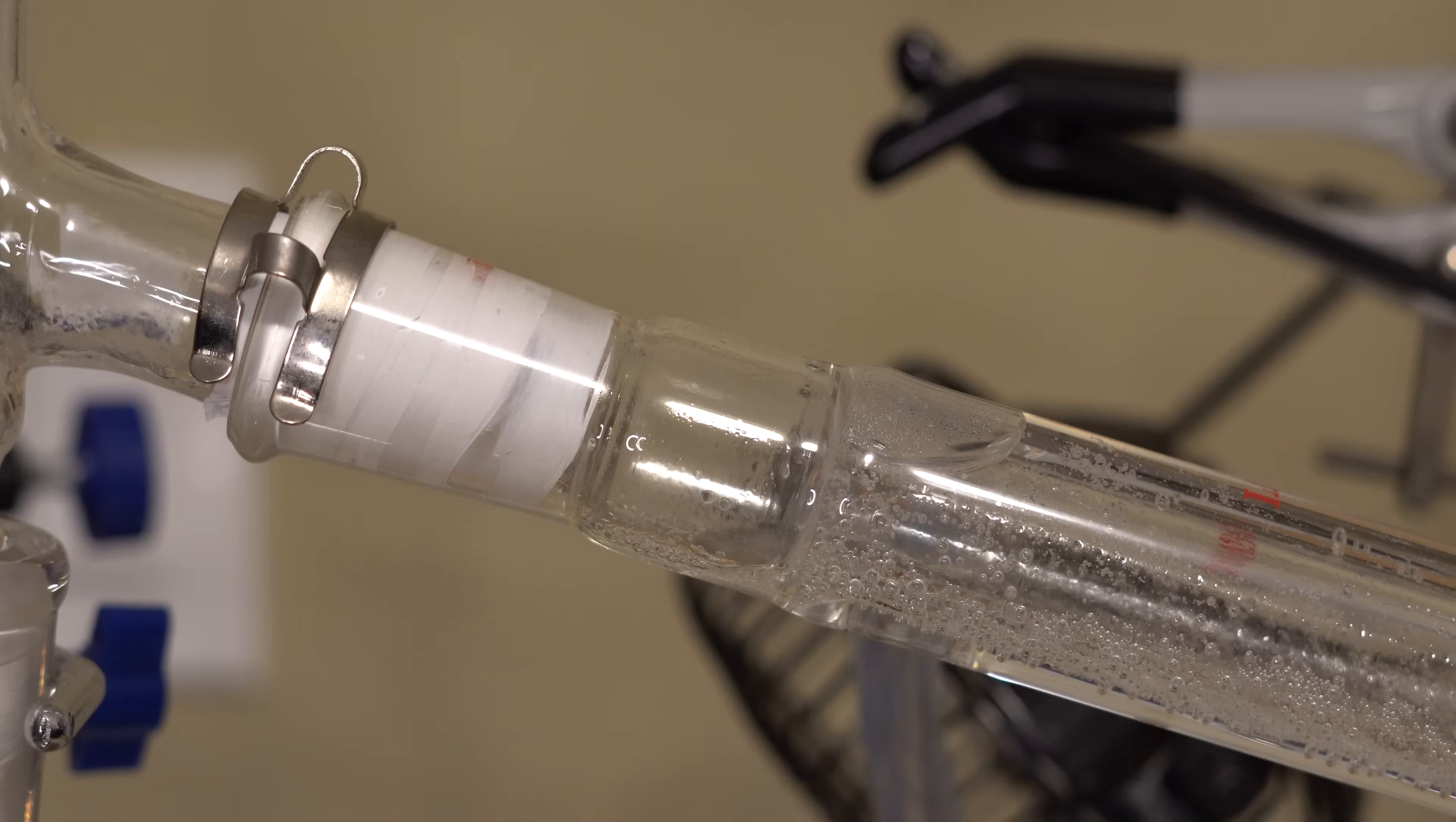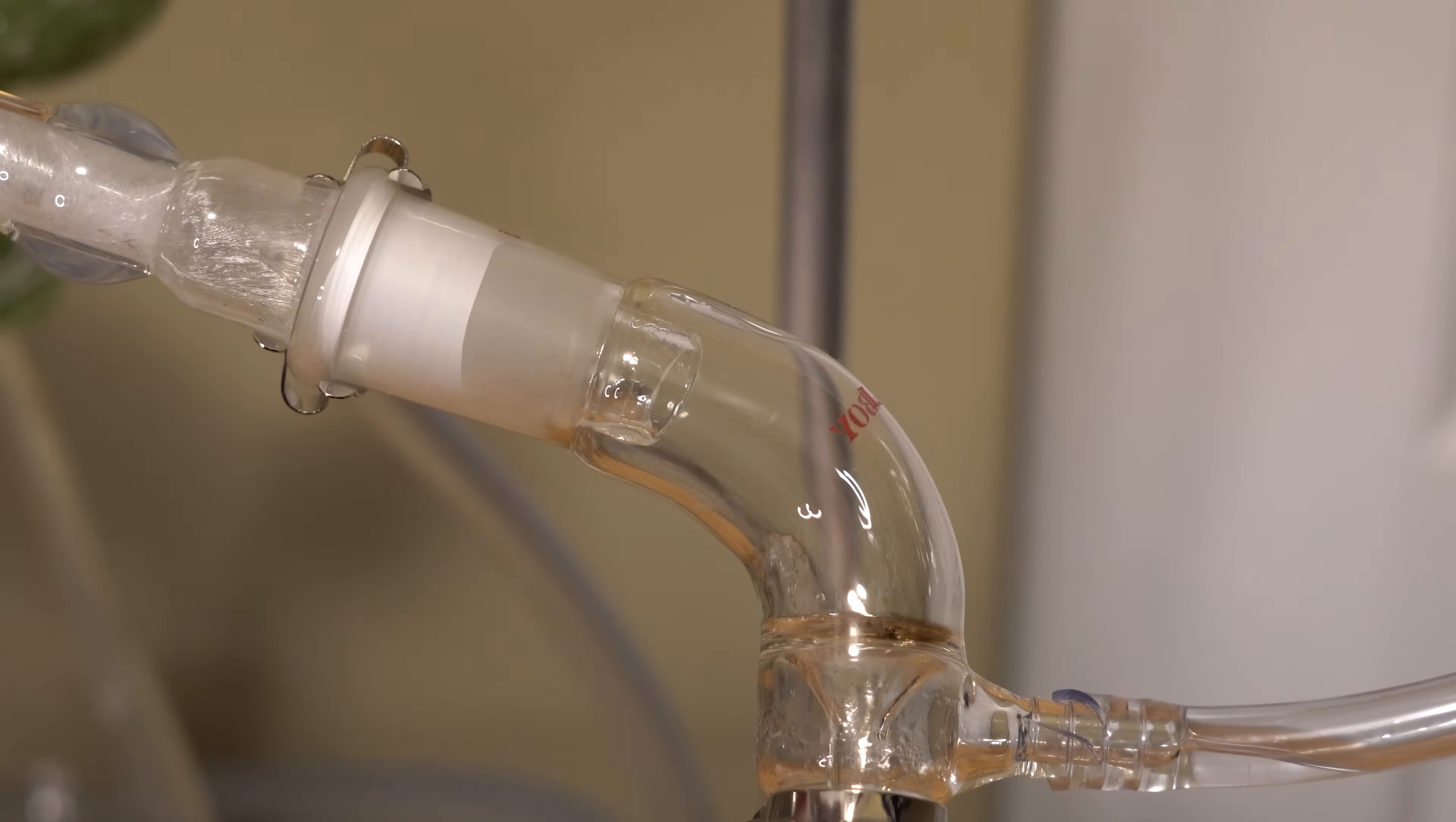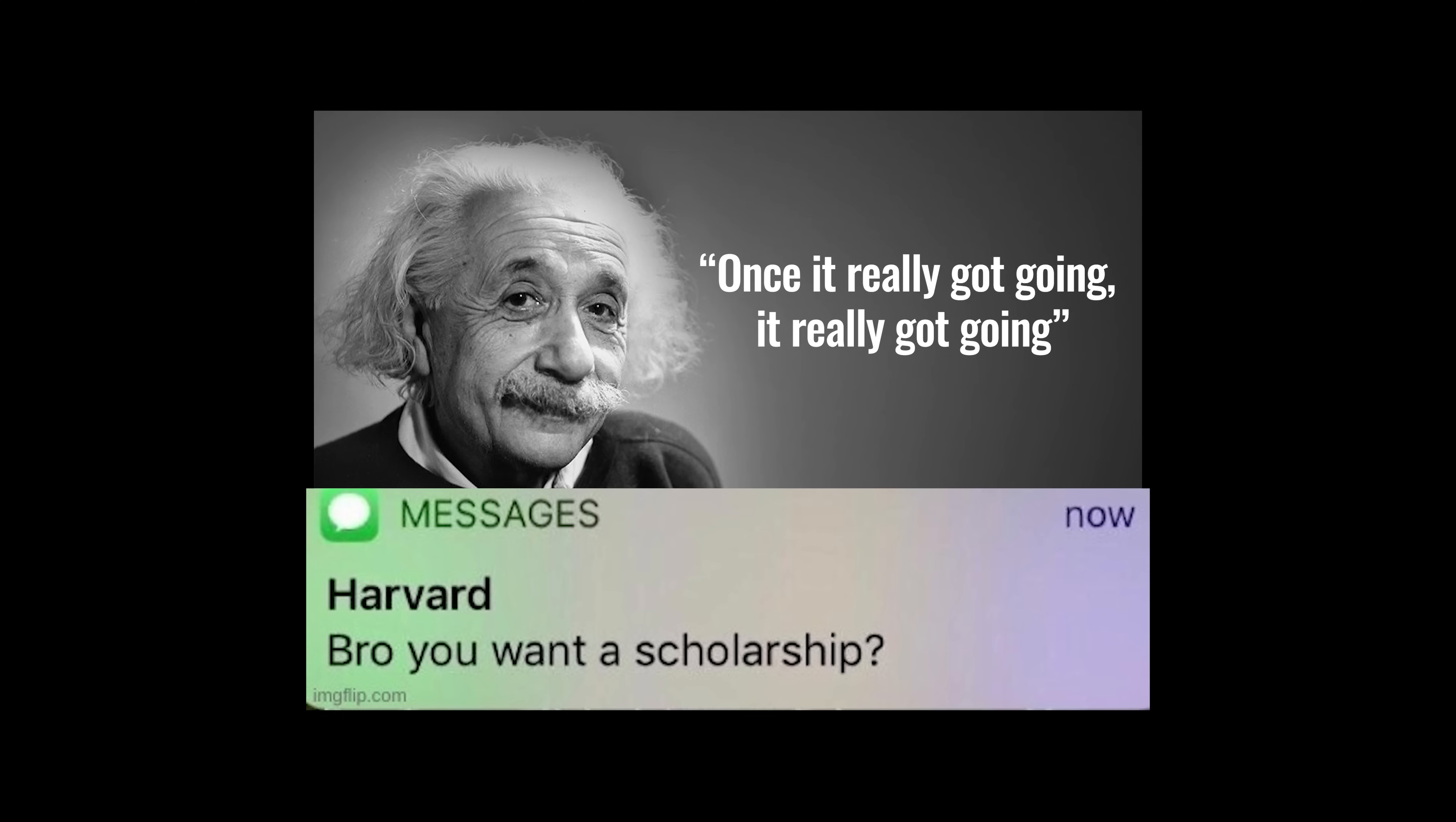As the decarboxylation progresses, we can see our beautiful droplets of phenyl coming over. Once it really got going, it really got going. The prophecy is true. Phenyl does like to clog up the condenser, as its melting point is a lot higher than other compounds.